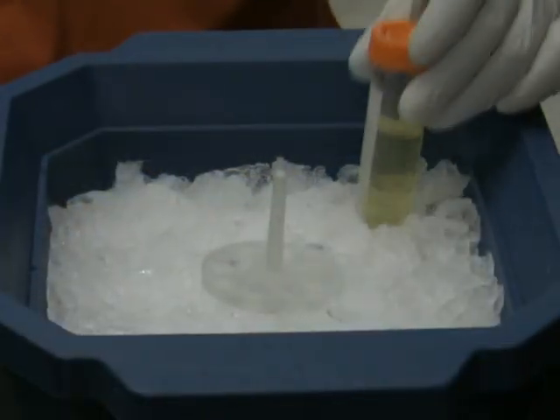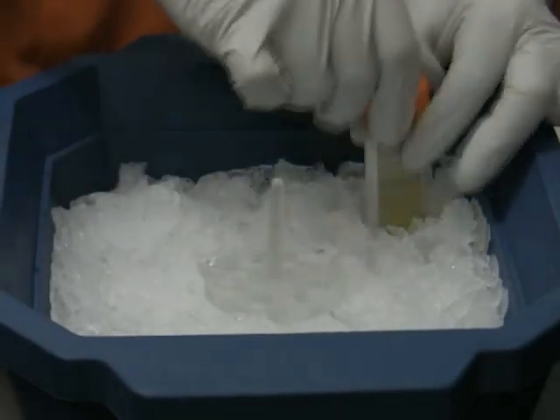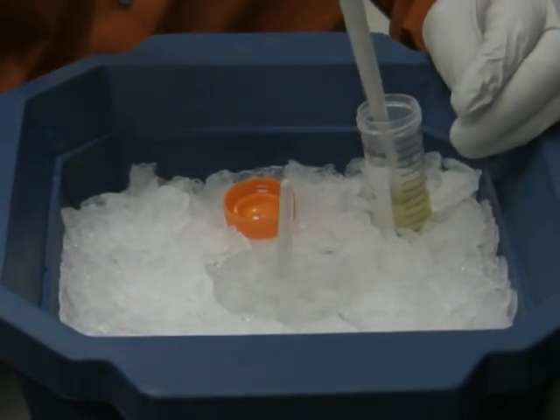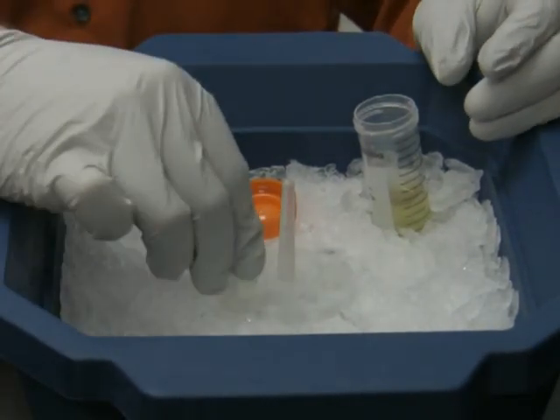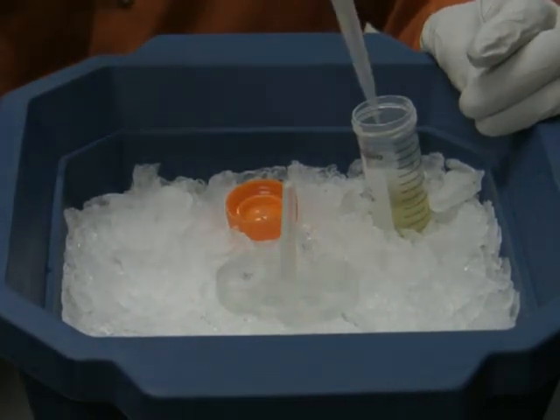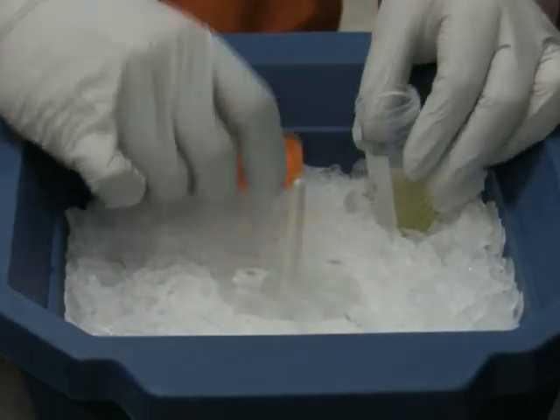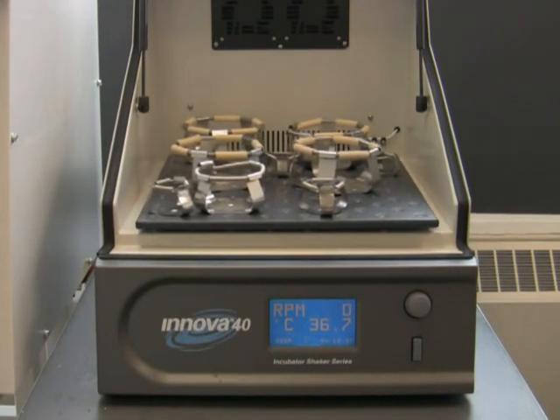Now I'm going to add 800 microliters of LB medium without antibiotics. Then I will shake the tubes in a 37 degree shaker for 45 minutes so they develop antibiotic resistance.